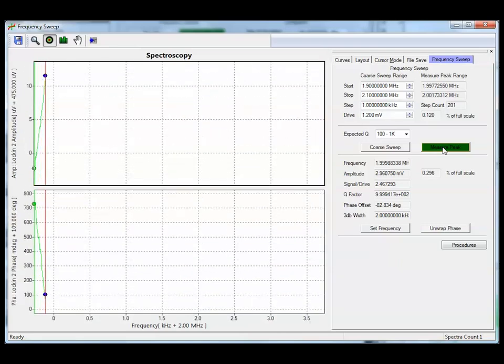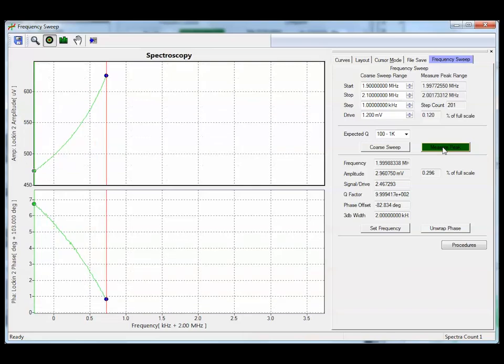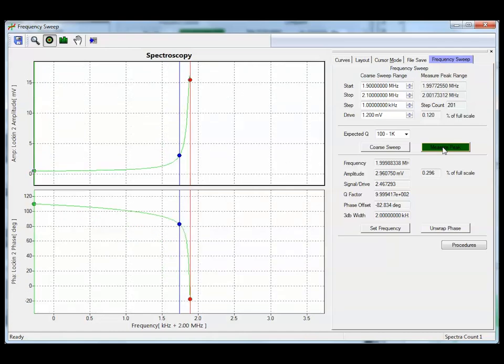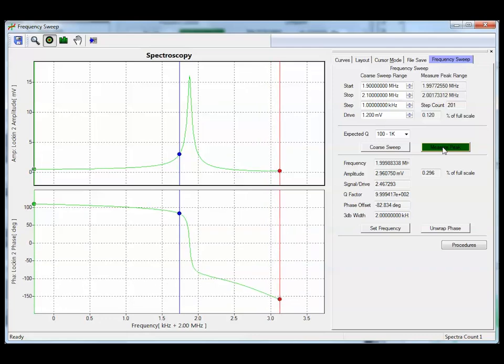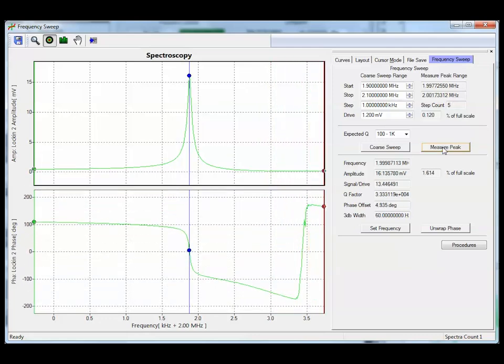it takes a little bit, and then we'll sweep through the peak between the 2 cursors. At the top peak position, the blue cursor will show up. It'll automatically get set to the top peak position. And we might see a phase wrap here. Yes, that was the phase wrap. The phase wrap here doesn't really hurt us that much because our operation will be in here.